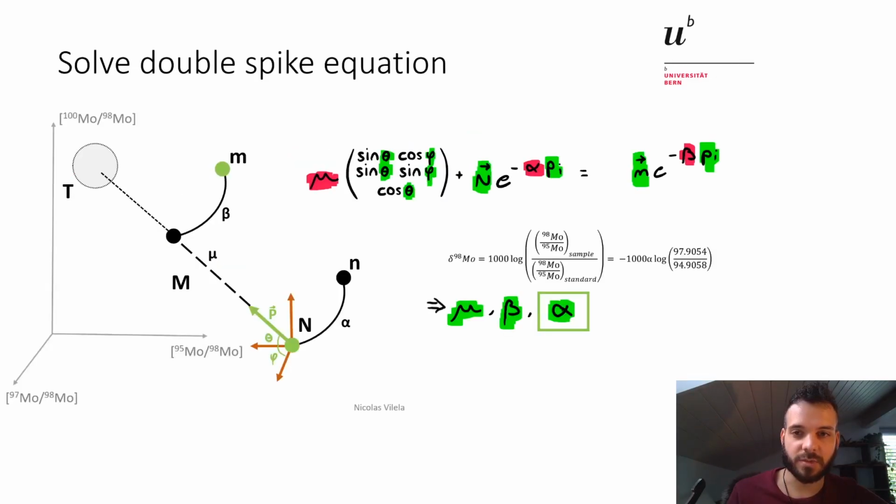In our isotope space, from now on, when we perform measurements, we will have our measurement that we will project along this path to get to this point, which is this side of the equation, and we say that we can get to this point via the path on this side of the equation, where we start at our standard composition and go in the direction defined by our unit vector to eventually meet the same point.